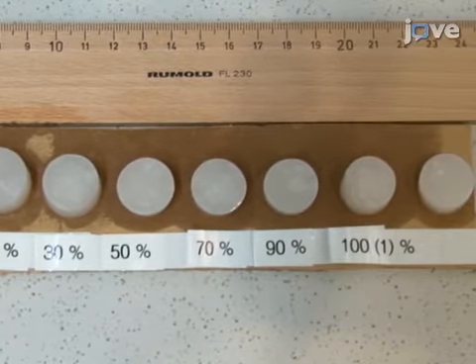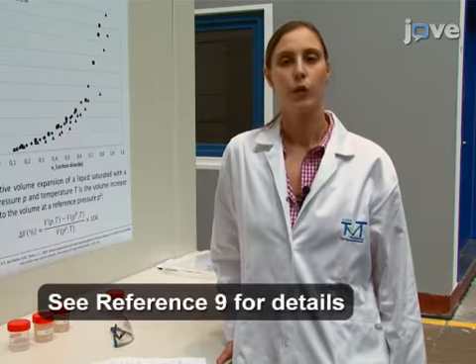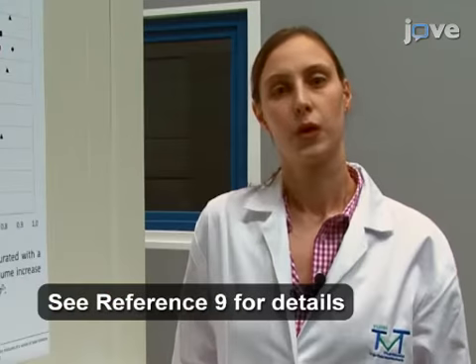Shrinkage of the gel will occur. Shrinkage is strongly dependent on the concentration gradient during solvent exchange, the biopolymer type and concentration, the size of the gel, and the degree of cross-linking. Always try to minimize the shrinkage because too much shrinkage will lead to poor aerogel properties.